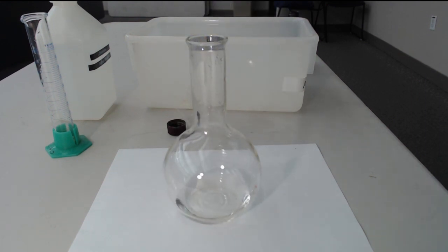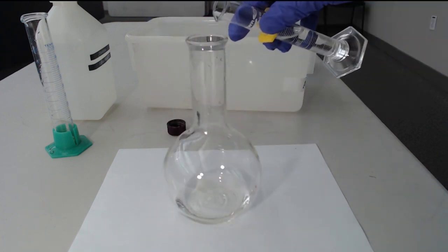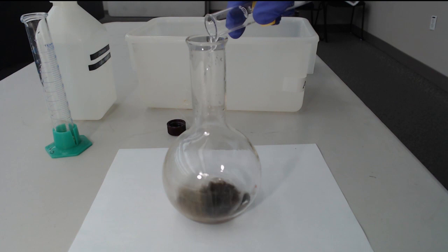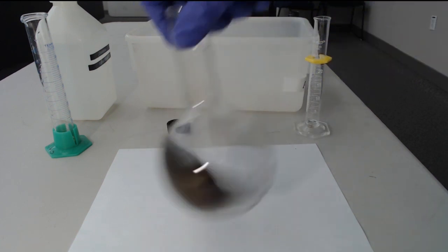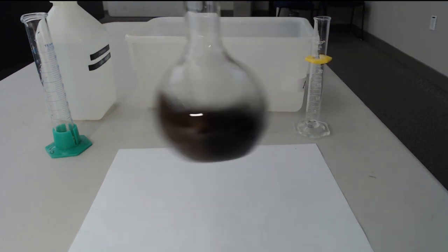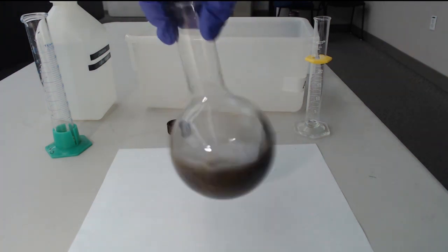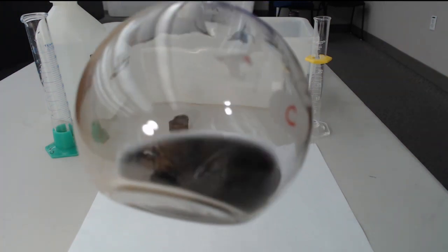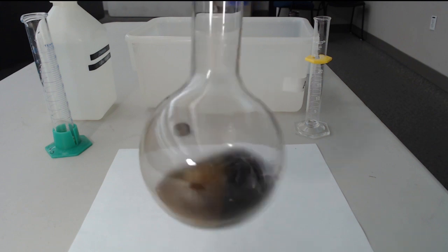I'm now going to go ahead and add the sodium hydroxide to it. We should see something else happen here. Now it's more of a black color than we had before. See that nice black color there. That's actually silver oxide, Ag2O.